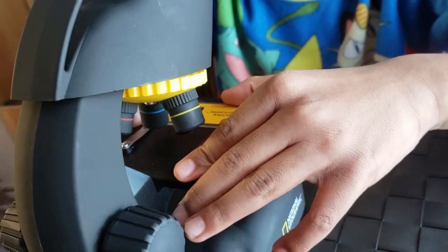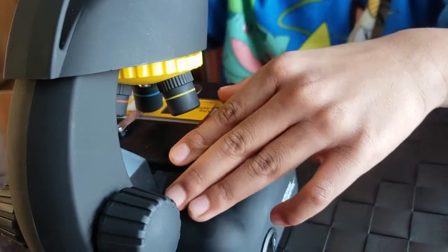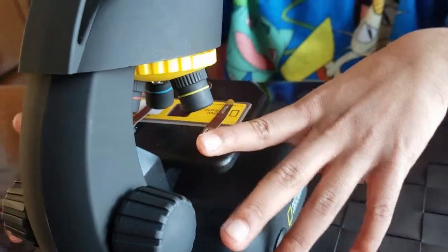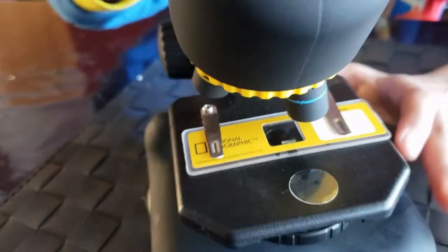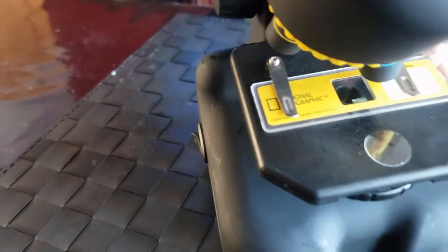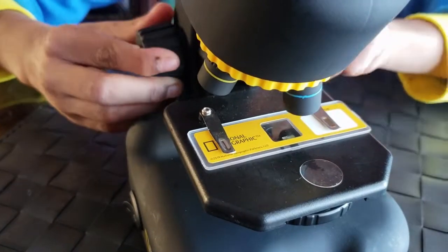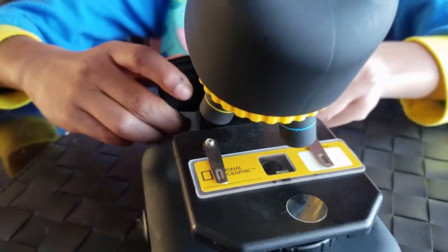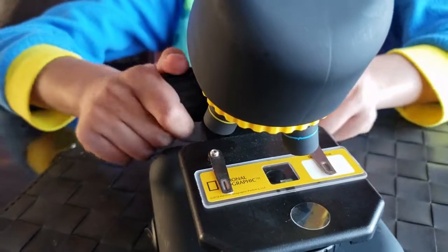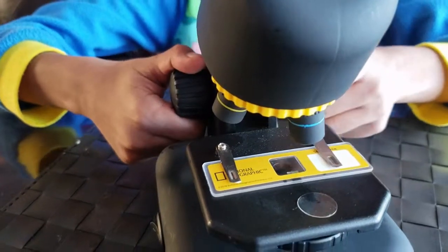So, how you do it is you first insert it like this to the stage clips. And then, I think you can get a glimpse of what's happening. Many of you probably don't see. If you do see, you can adjust. Like, pretend it's 40x and you think you can see anything. Look now, it's changing.